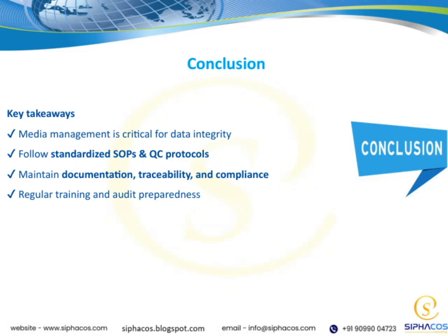Let's wrap up with some key takeaways. First, media management is absolutely critical for maintaining data integrity. Proper handling ensures that the data remains accurate and reliable throughout its life cycle. Next, it's essential to follow standardized SOPs and QC protocols. These procedures help us stay consistent and prevent errors that could compromise our results.